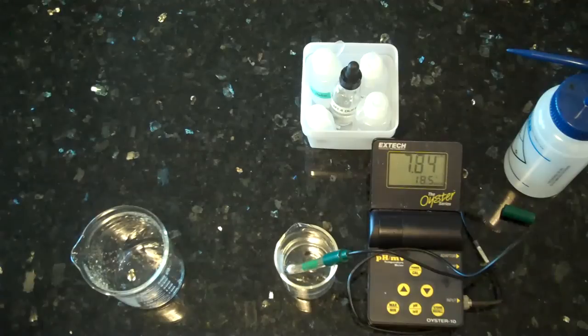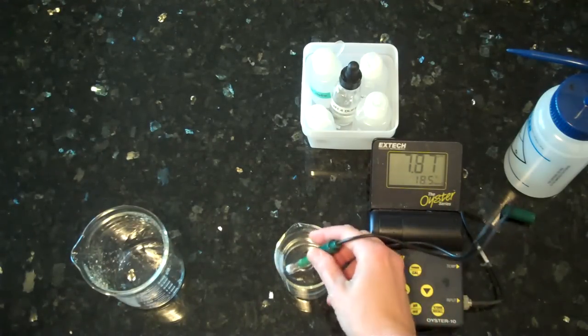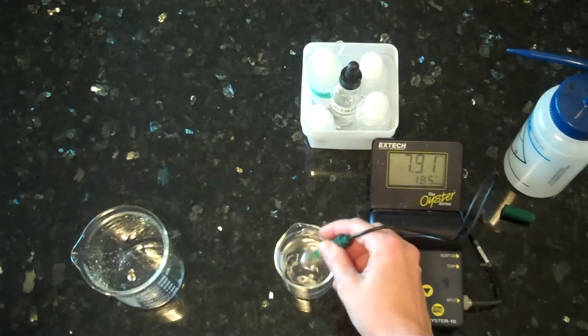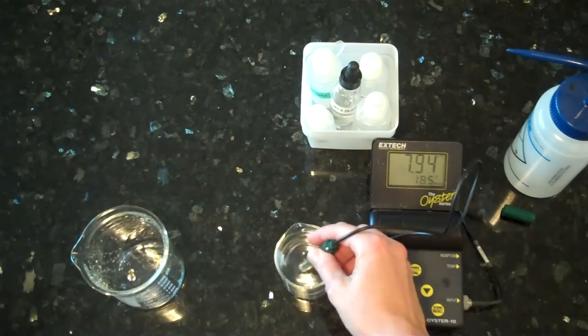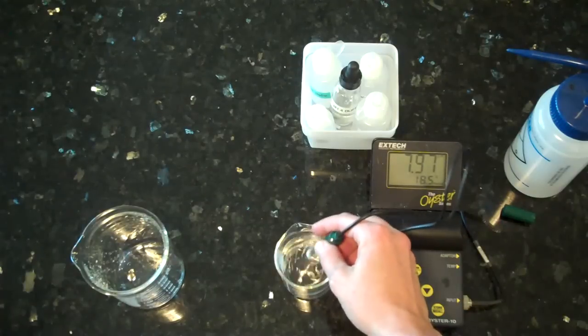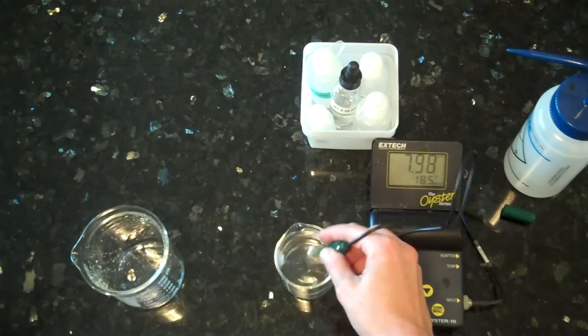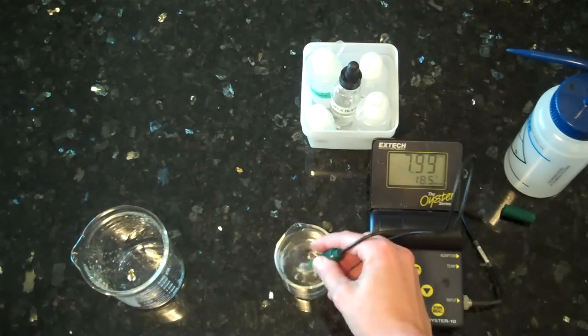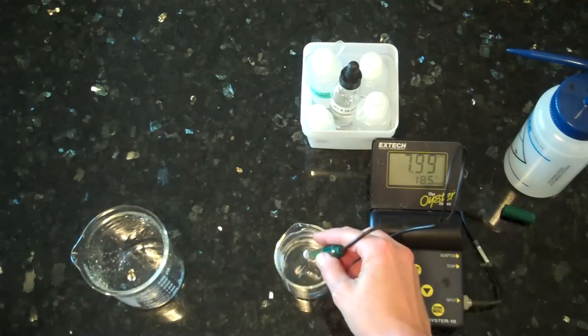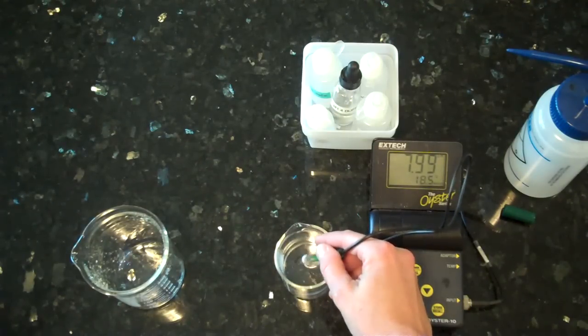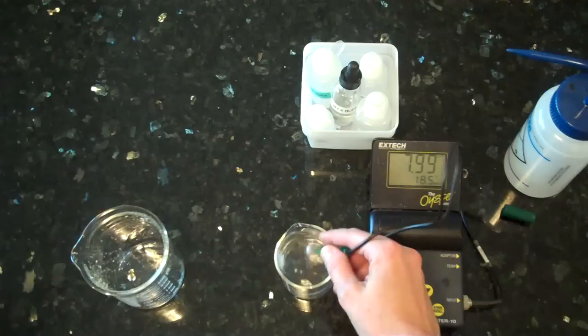Sometimes it takes a little while for the pH to settle. Jiggling it back and forth can accelerate this. Note that I am not stirring. Never stir a solution with the probe, because that can result in breaking the bulb. If you need to stir a solution, please use a stirring rod.